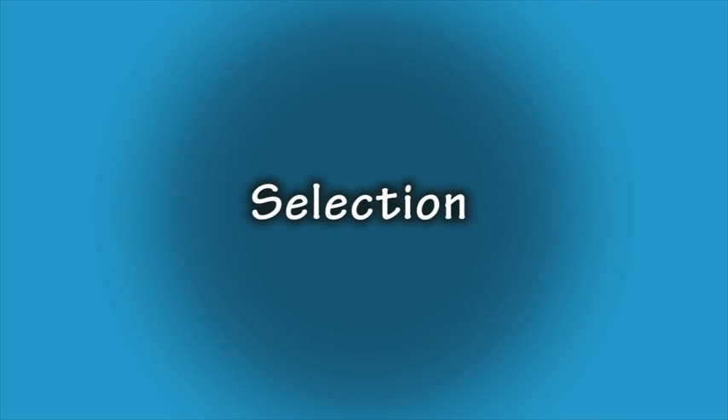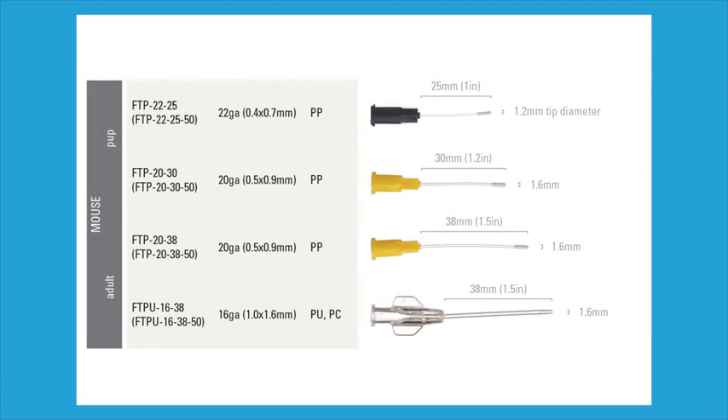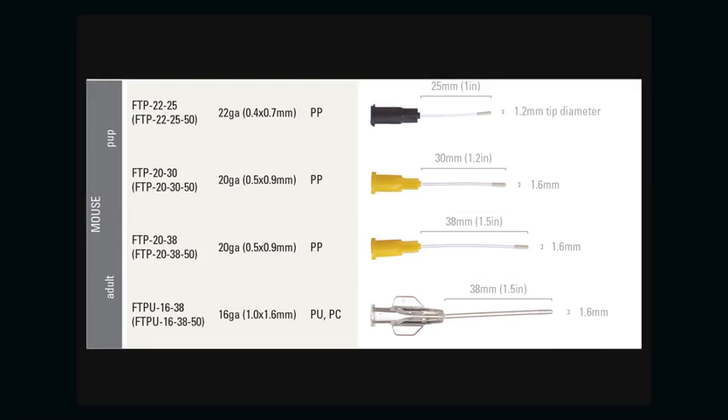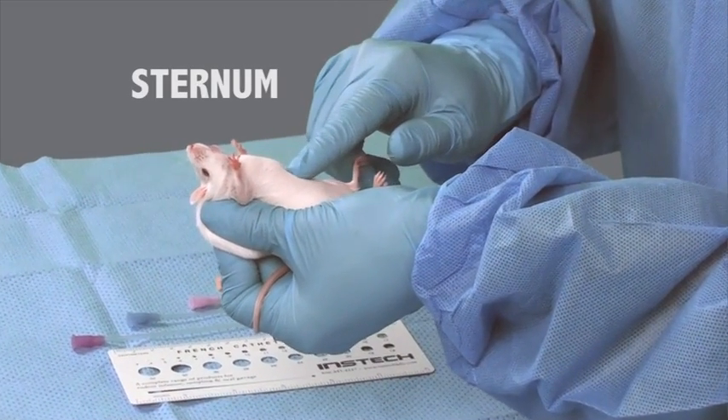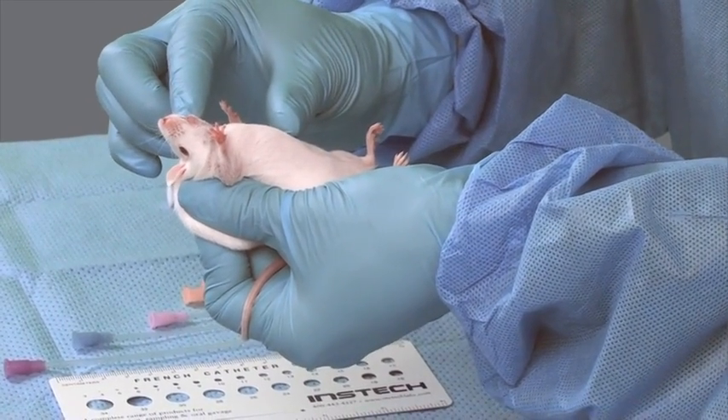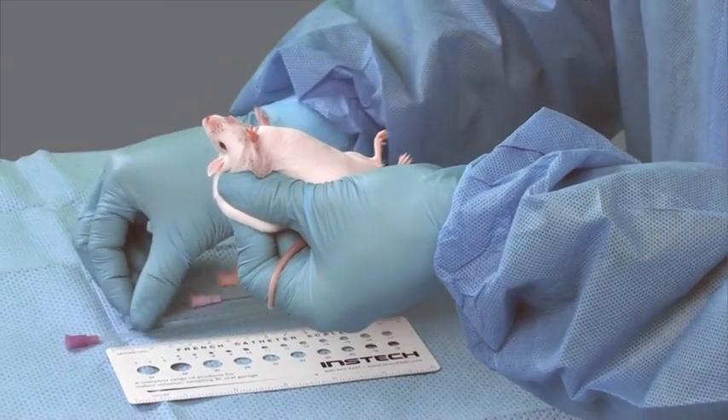It is important to select the correct size of feeding tube to ensure proper delivery of the compound as well as to avoid injury to the animal. Here are various sizes of mouse feeding tubes. There are general size guidelines according to the weight of the mouse. The FTP 20-38 is the most commonly used size for mice. Here we see veterinary technicians assessing the appropriate size feeding tube to use in this mouse.